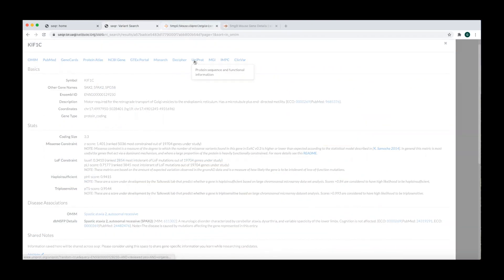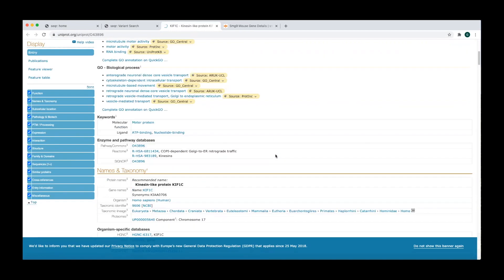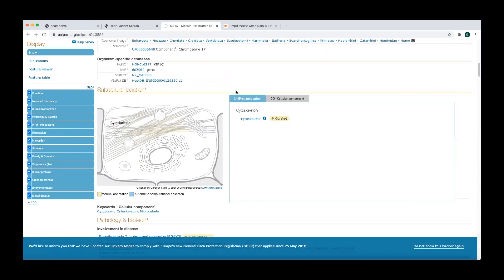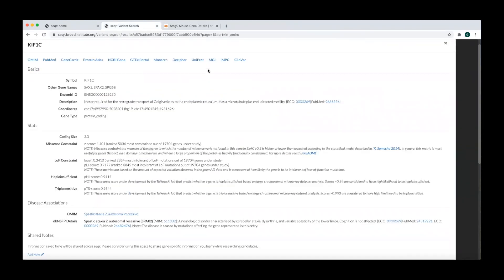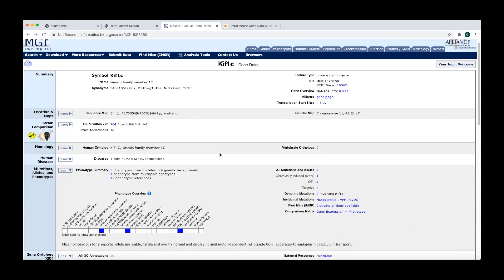The UniProt webpage provides information about protein-protein interactions, functional domains, and other information that may provide clues to understanding gene function. The MGI and IMPC links are useful resources for finding information about available mouse models for the gene, including associated phenotypes.